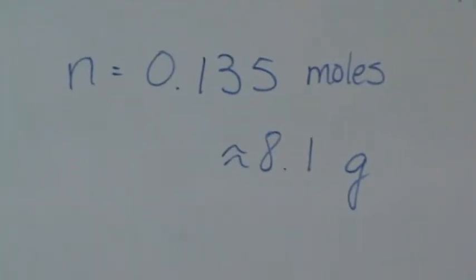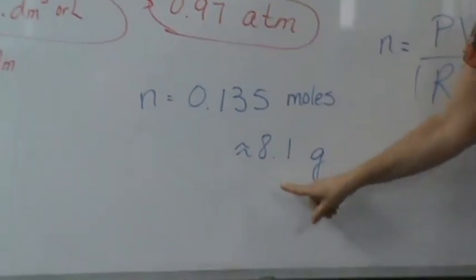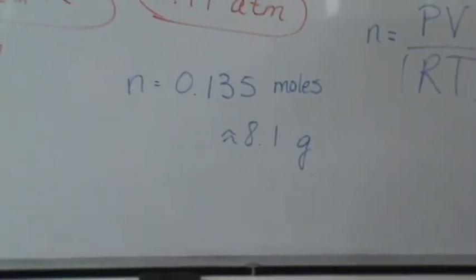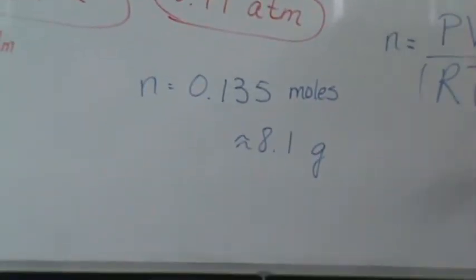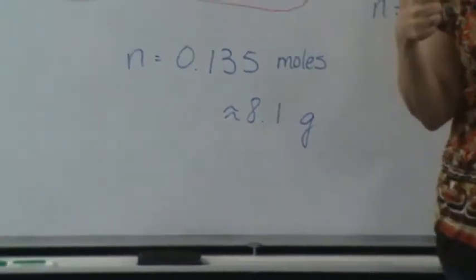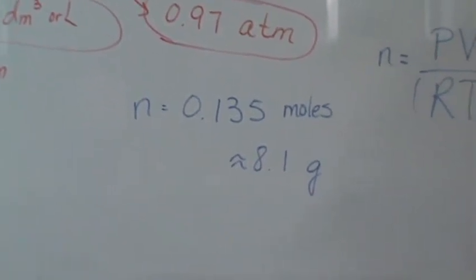Basically, the percentage will just be this divided by 200, right? And actually, you guys are almost identical to his numbers, which is pretty fun. Most standard vinegar will be around 4%, and I think that's what you're going to get, right? So 4%, you guys are right on. Good. It worked. Yay.